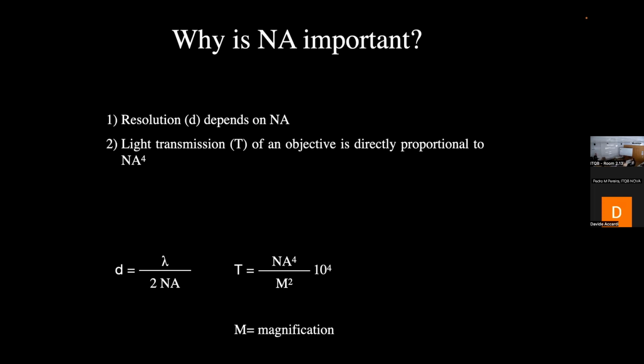This is important that you remember, because if you have 2 lenses with the same numerical aperture and different magnifying powers, then you have to know that the higher the magnification, the less light will pass through. Which might be counterintuitive, because usually people think a larger magnification is better. And it is better in certain cases because you enlarge the image more, and certain systems need that. But if it's not needed, then you are just losing lots of light.